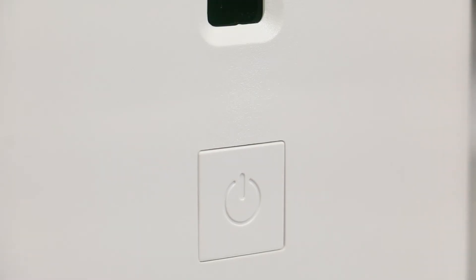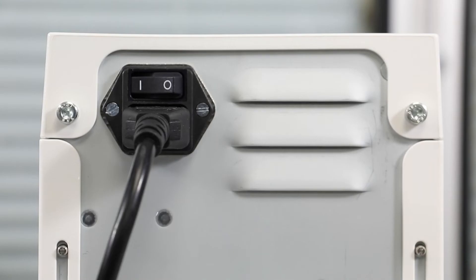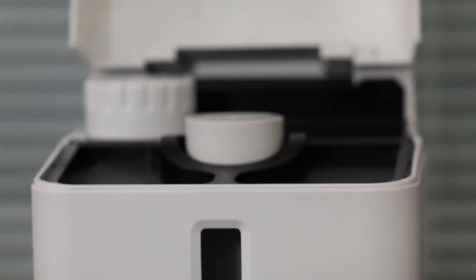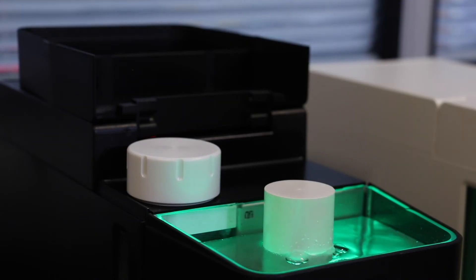Step 1: Press and hold the power button for five seconds to shut down and depressurize. Now turn off the main power switch at the back of the unit. Step 2: Open the top panel by lifting gently.